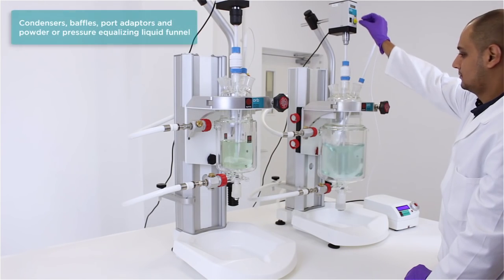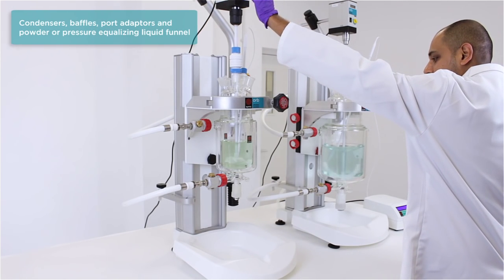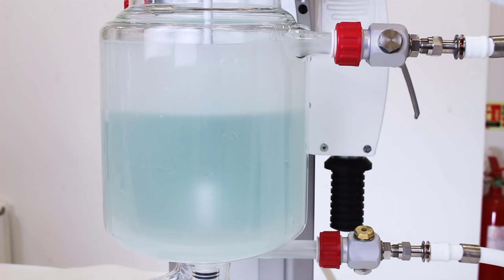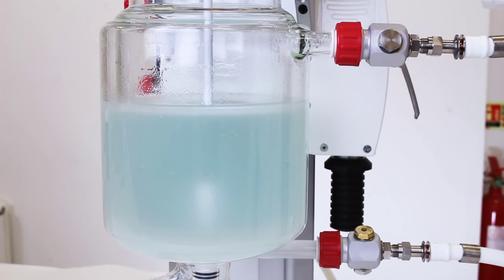Many accessories are available including condensers, baffles, port adapters and a powder or pressure equalising liquid funnel. Optional rapid oil drain allows oil to be safely and cleanly drained from the jacketed reactor back into the circulator.